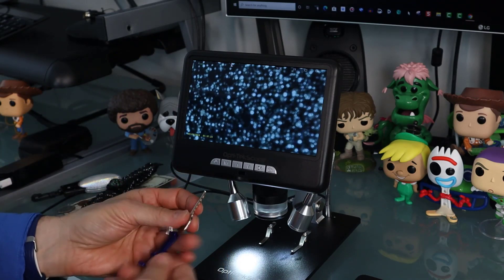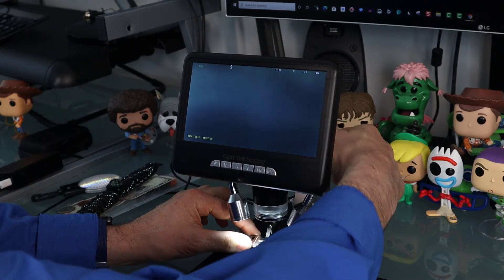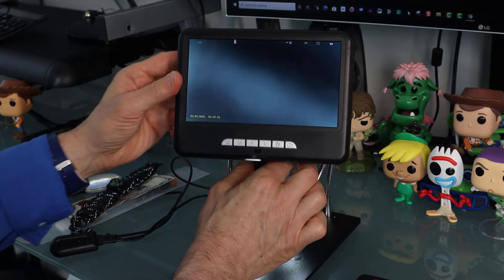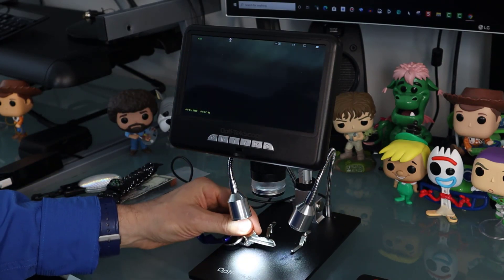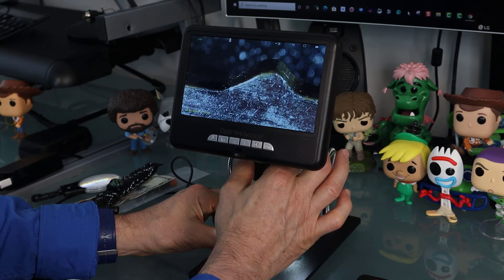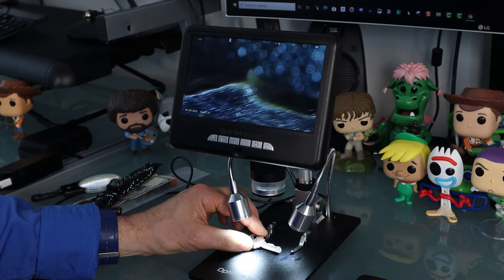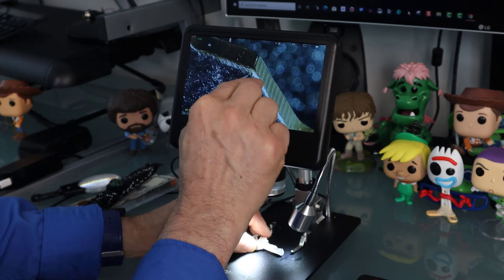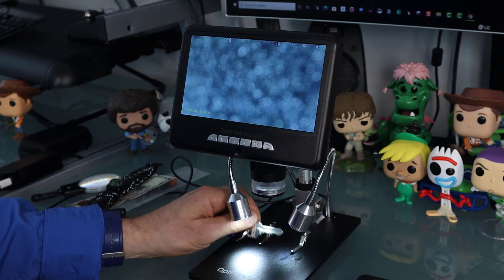Now let's look at a key. Moving this up just a little bit — hopefully this gives you an idea of how cool that is looking at all these different items. You can really have a lot of fun with this. Look at that detail. You can see something specific, like the curvature on the key and how it matches your specific lock. Very cool — that is a key.